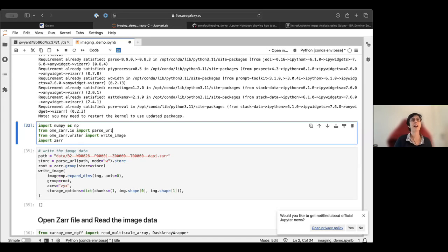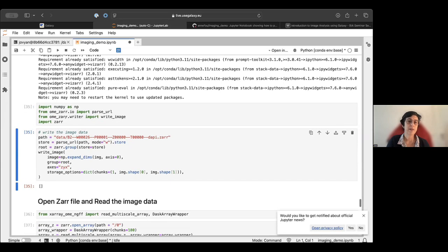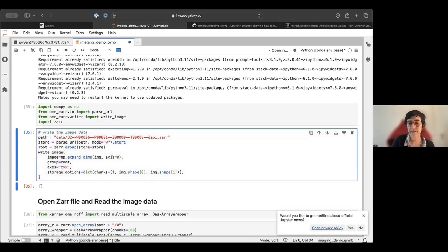But I also can parallelize because here I have a small image, but when I want to run on a big, not only on a large number of images, but on one big image, maybe I want to split the computation and make it in parallel. So here, let's start to write first this simple image. From a small TIFF here, I artificially create a Zarr file where I'm using this OME-Zarr. And because we have only one 2D image, I create only one level in the OME-Zarr.